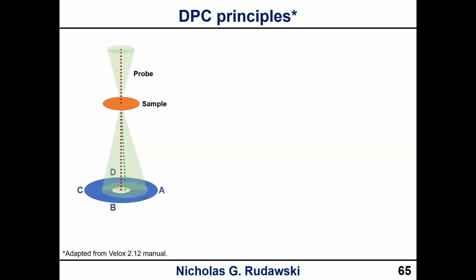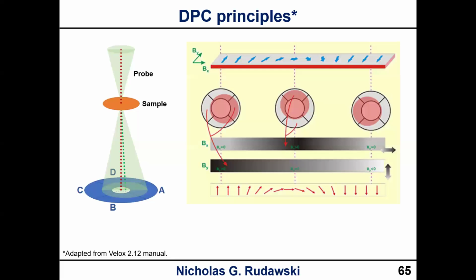Okay, if we look at this from the standpoint of a magnetic field, think back to your physics. Force from a magnetic field on a charged particle is QV cross B. Let me use my mouse here. This is my sample here, and the magnetic field is oriented as you see with these arrows.